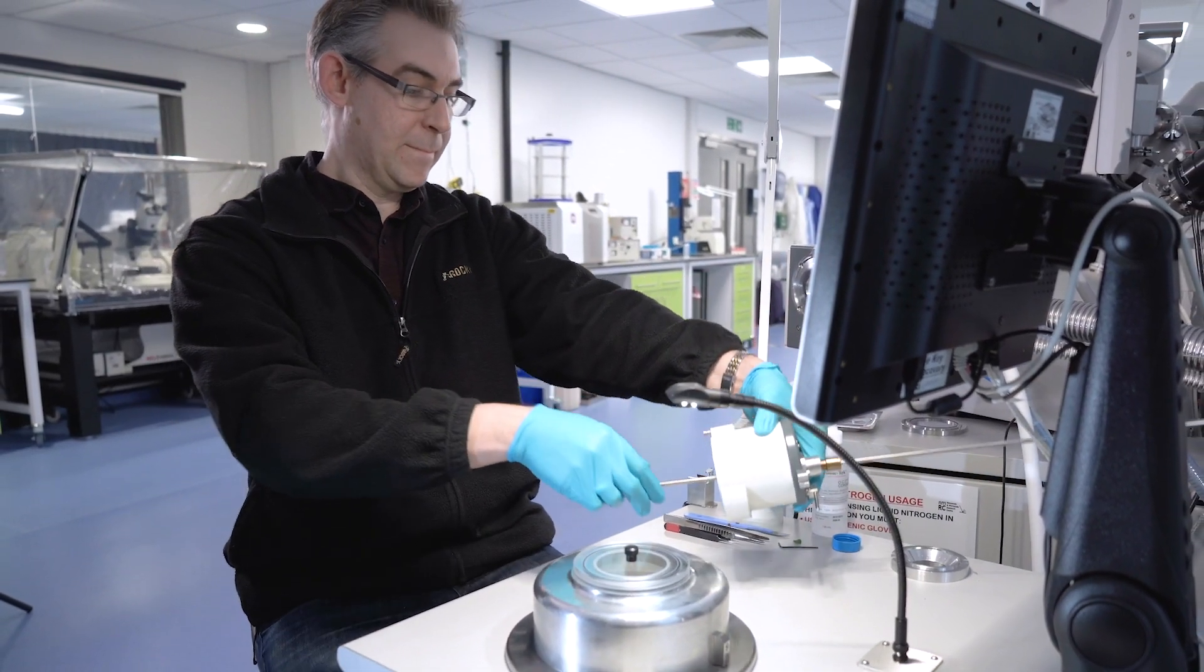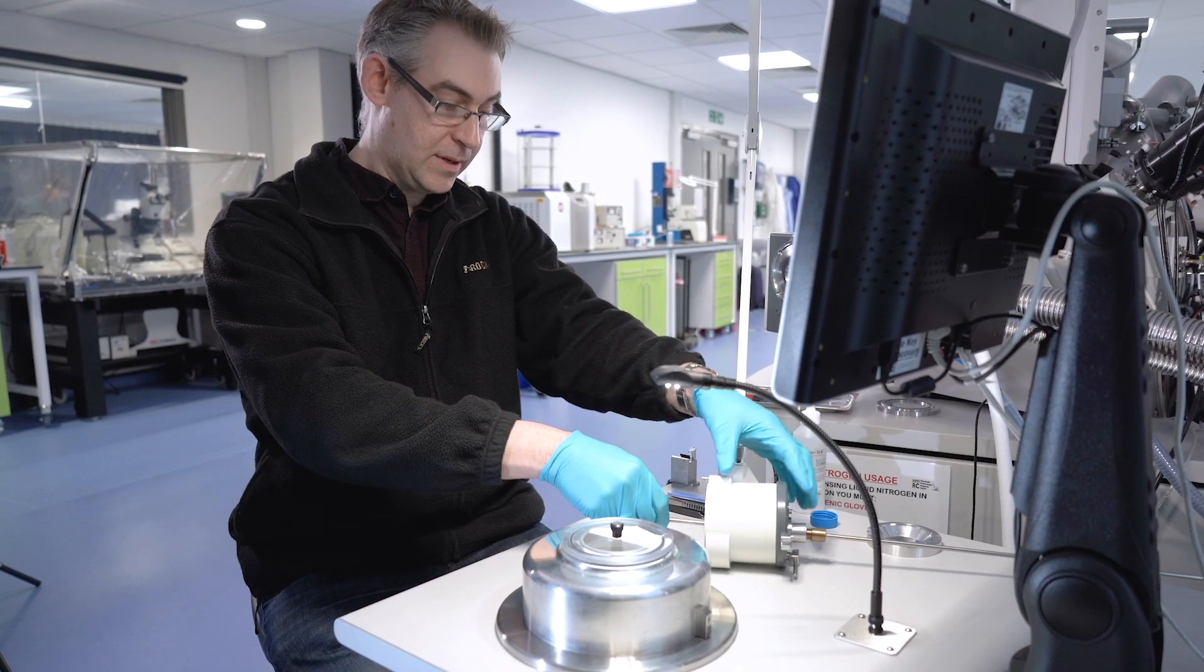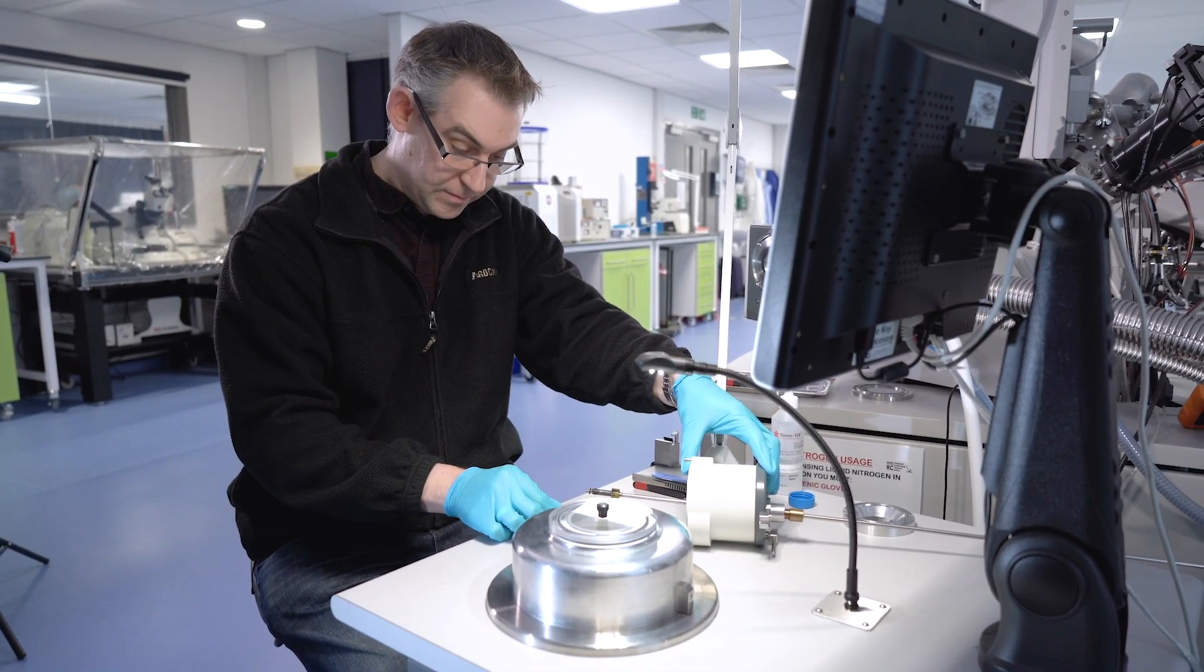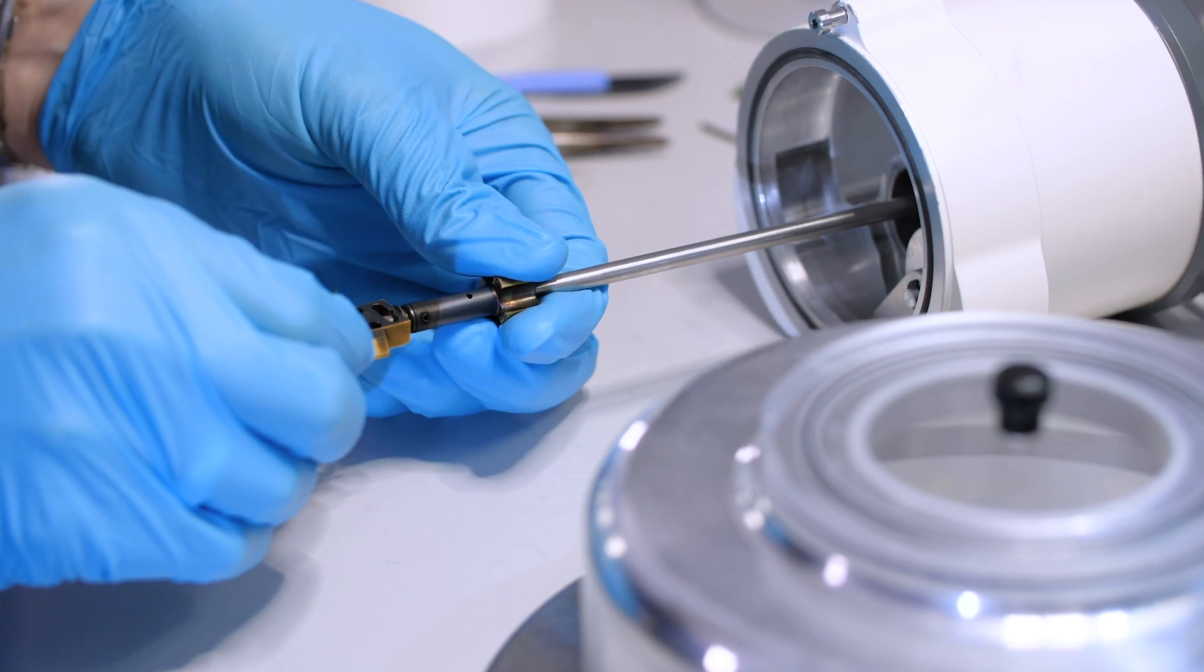So having loaded the sample onto the shuttle, Chris is now going to fit the shuttle onto the transfer rod. This is a simple 90 degree bayonet.